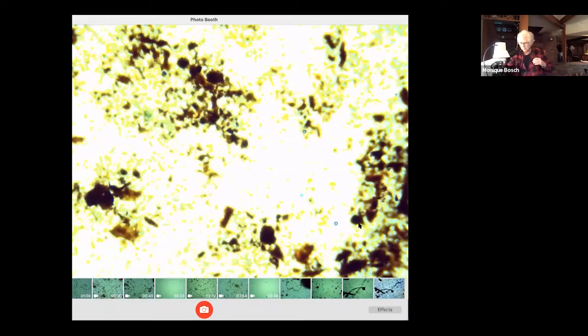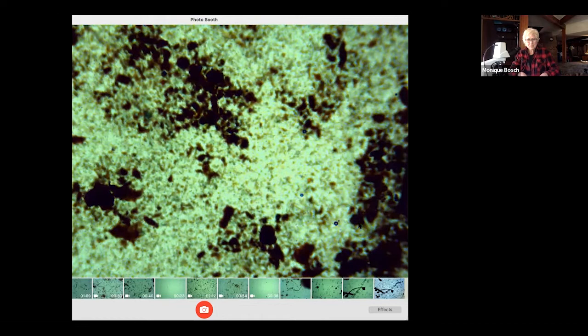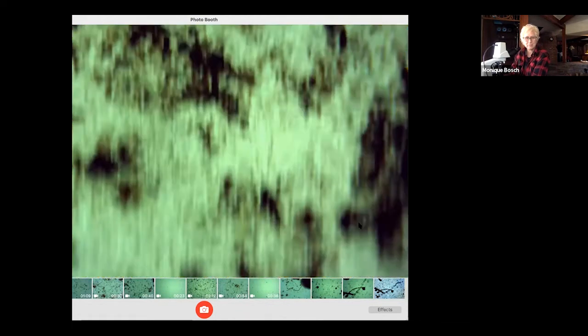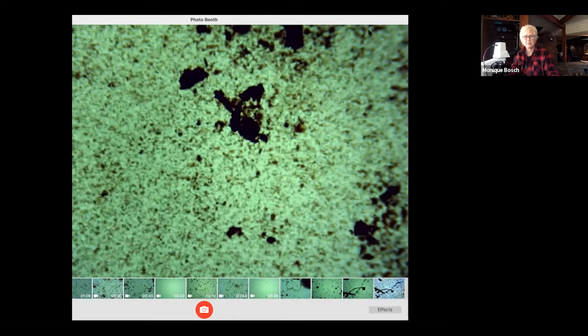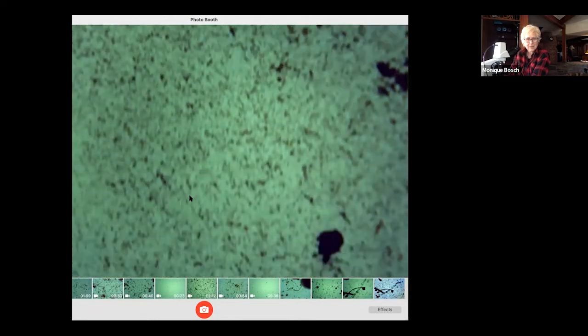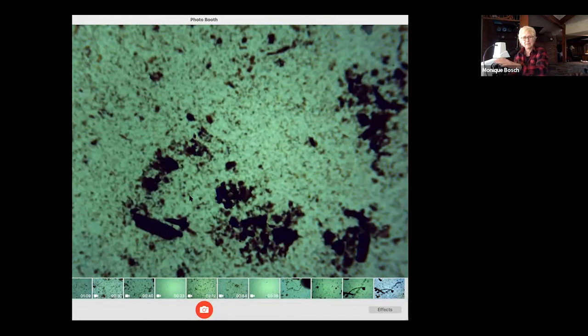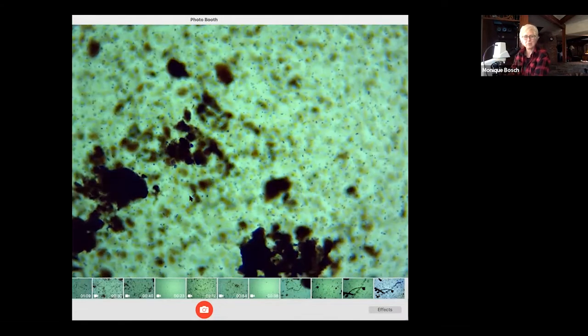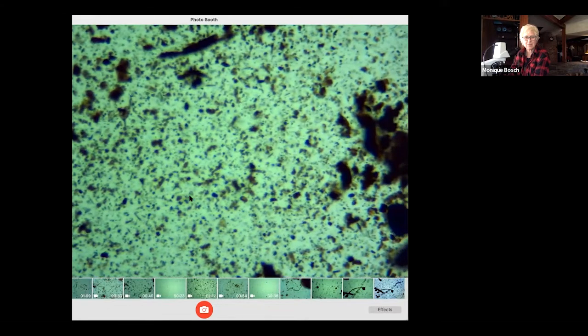Cool. We're at 40 times magnification here. So this is the compost that we're looking at in real time. Isn't that cool? So that's really full. So it's hard to tell at 40 times magnification. And this is really quite dense. I did notice as the drop went down, it didn't spread out as evenly as I would have wanted, but this is now 100 times magnification.